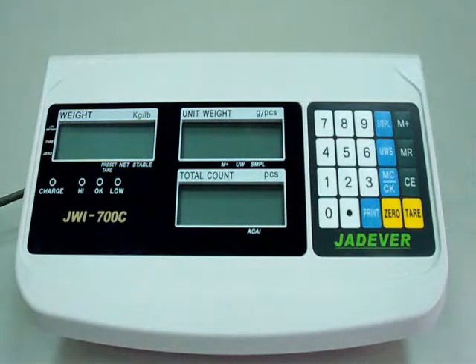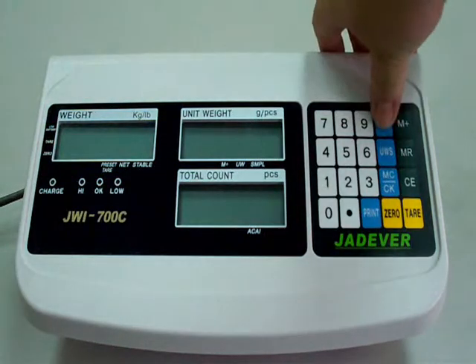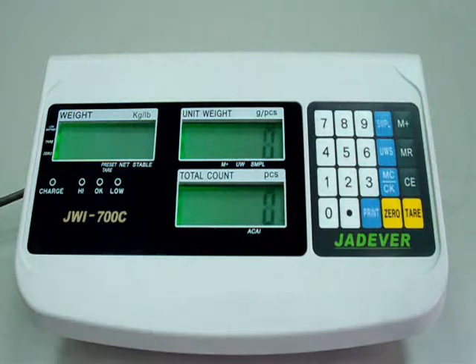Single Point Calibration. Turn on the power while pressing key sample to initiate single point calibration. Input 11 with numeric keys.